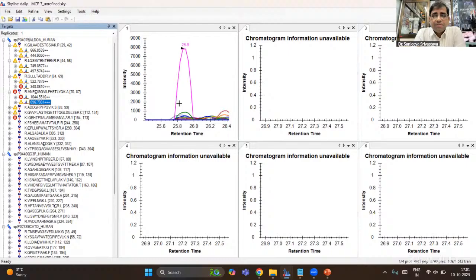And Saraswati, thank you for a very quick overview of targeted proteomics. Students who really want to do this exercise have to spend more time on it, because this is just one round. After that, you have to do a lot of refinement and rerun the samples. Many things happen to make a good targeted assay. But the major advantage here is we are not using antibodies. We can directly validate the peptide using workflows from either Orbitrap or triple quad based mass spec.